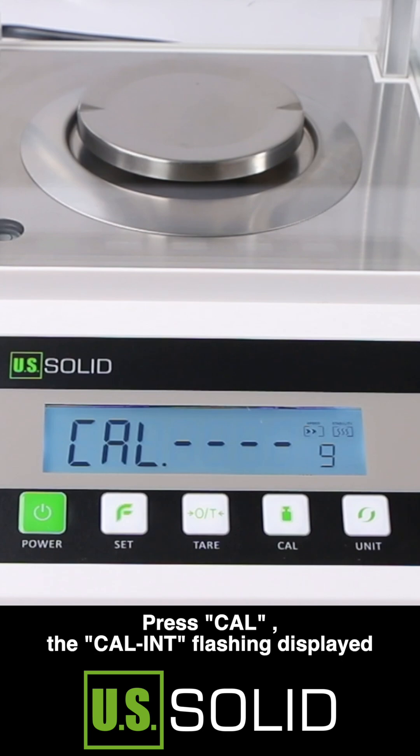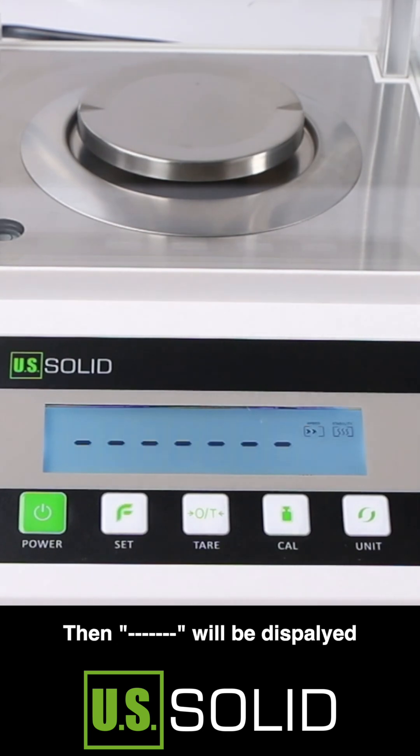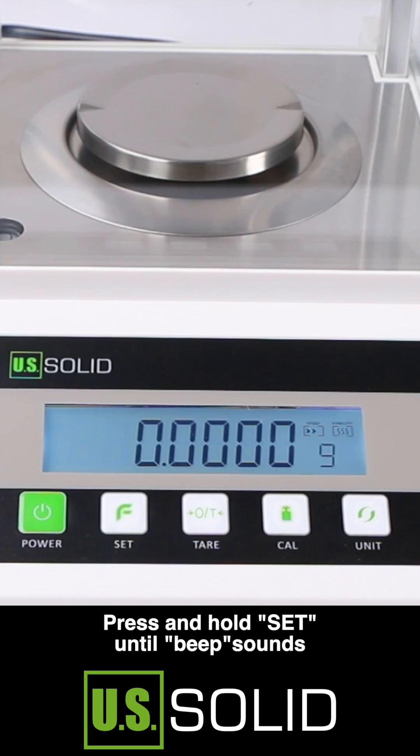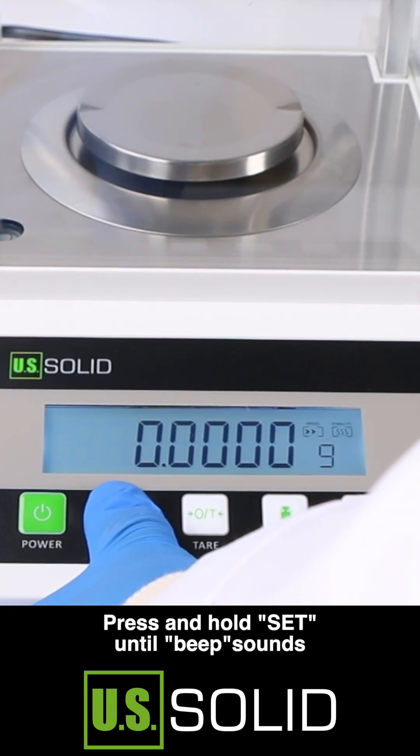Press TAR to zero, then press calibration. The CALINT flashing display will appear, then ellipsis will be displayed. Zero is displayed when finished. Press and hold SET until a beep sounds.